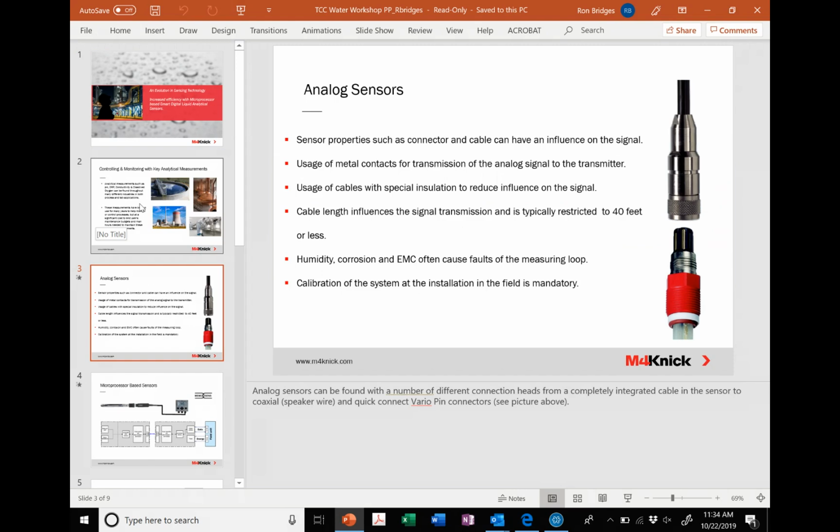Today, a lot of the challenges in this technology have to do with the cable that's used to get the signal from the electrode to the transmitter itself. It's a coax cable. It's susceptible to noise, so there are some influences that can affect the signal quality.